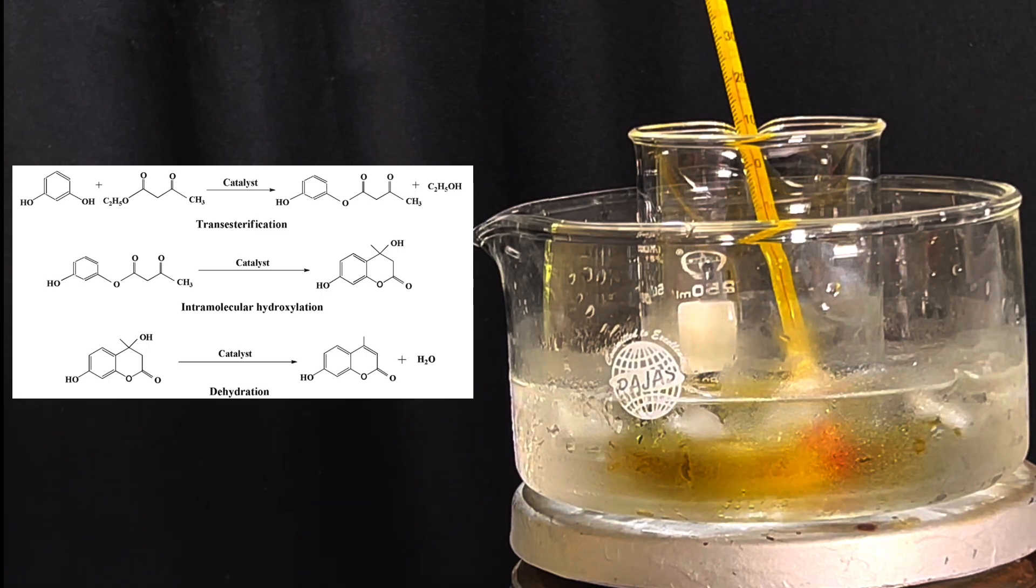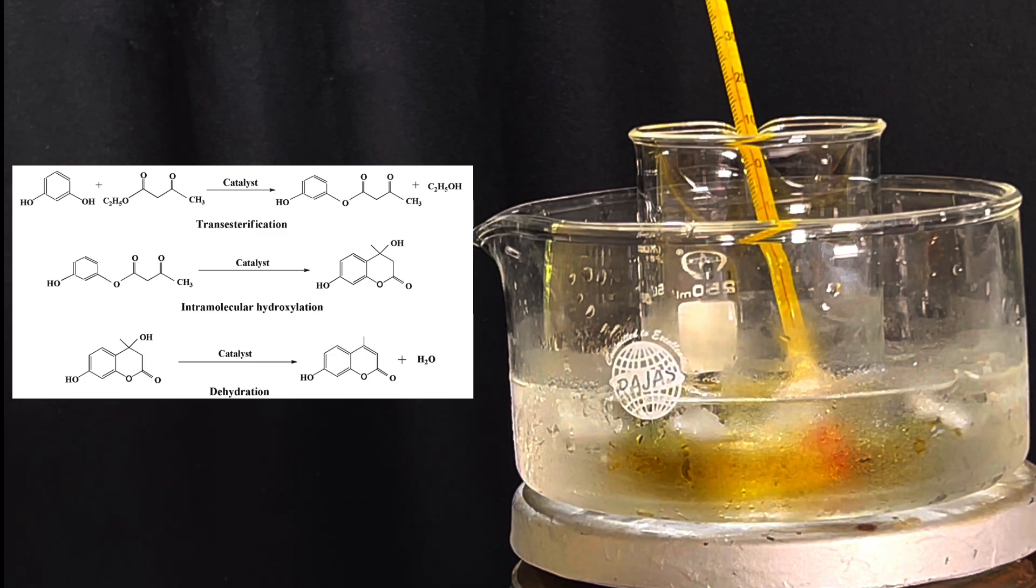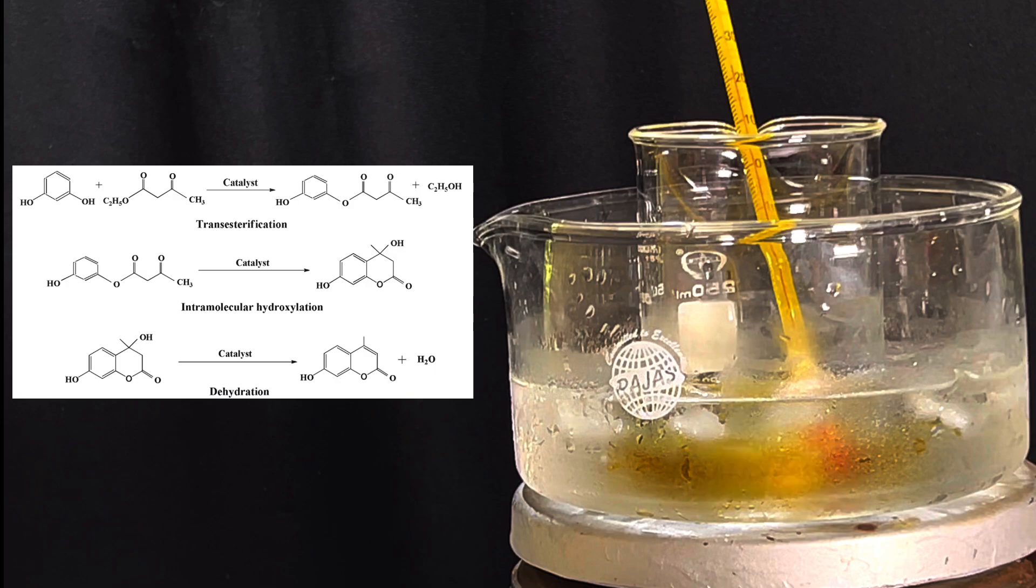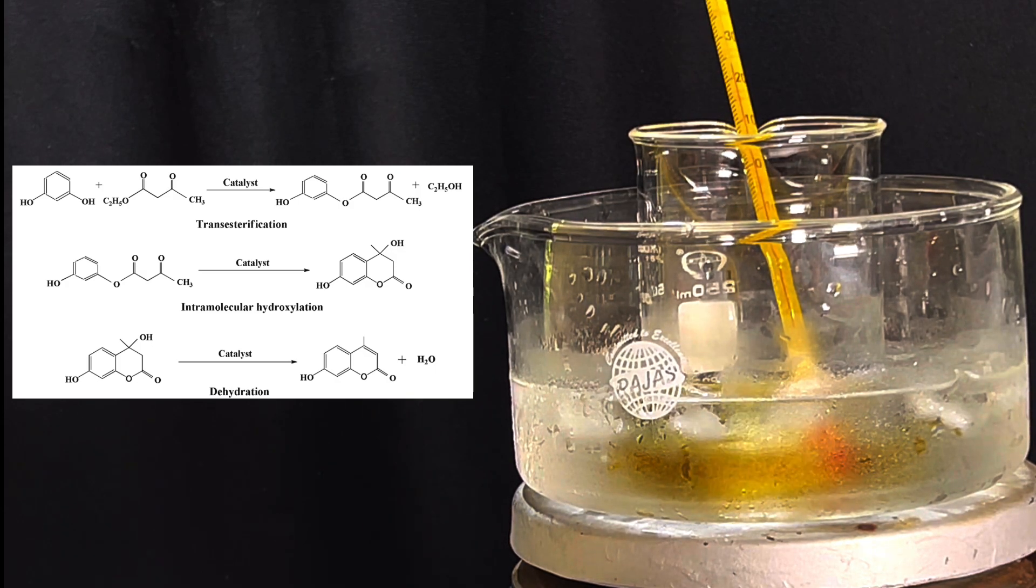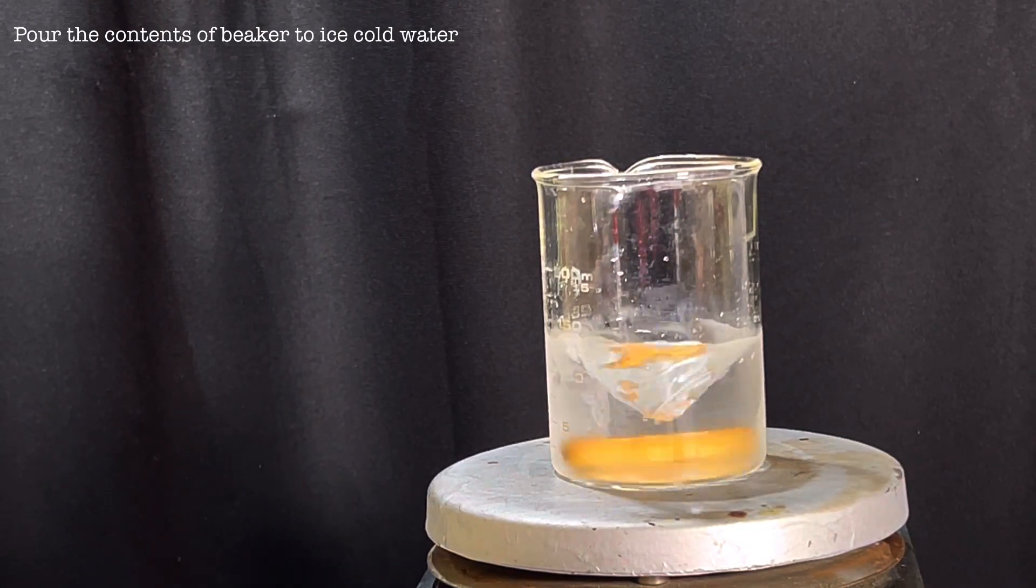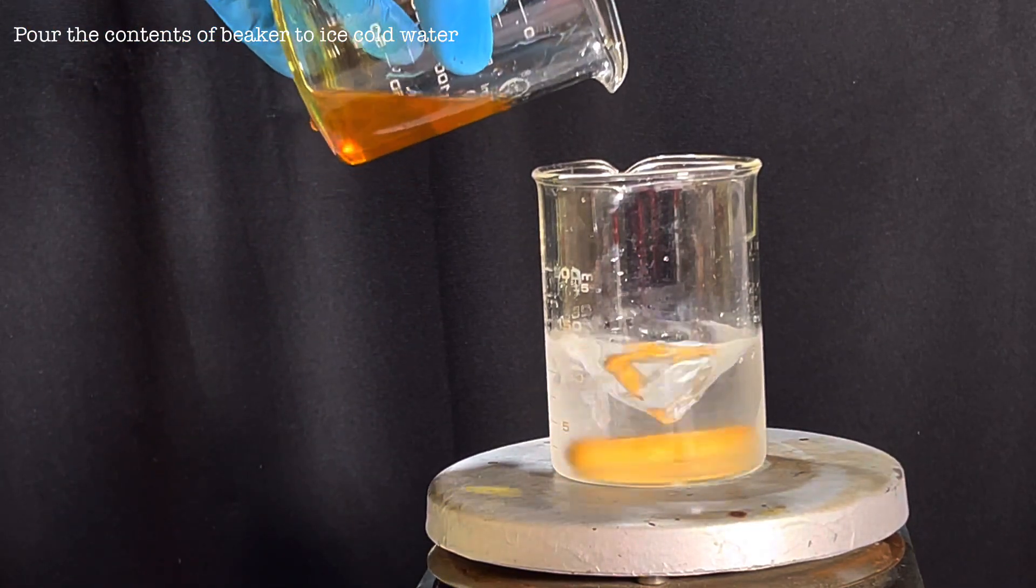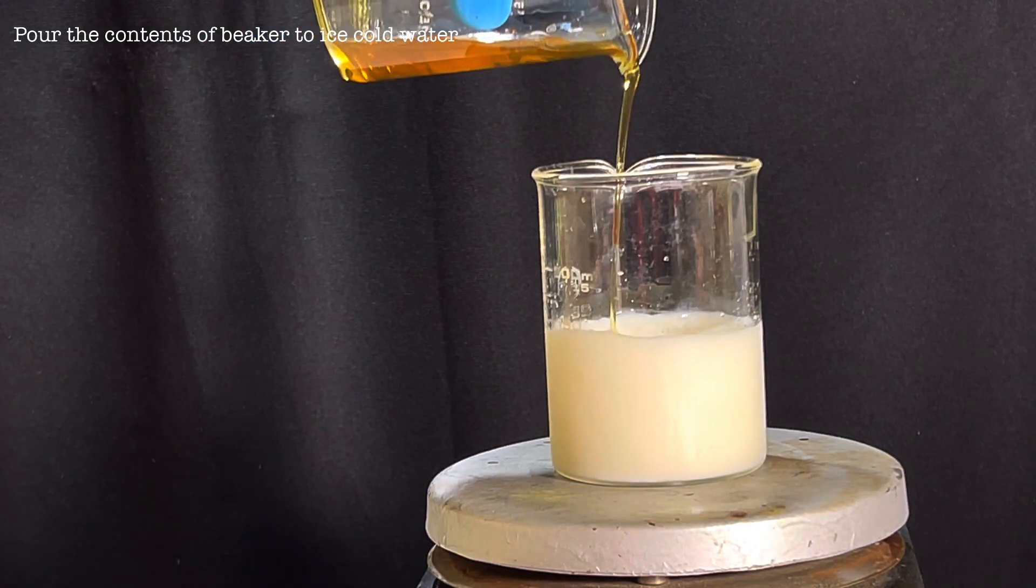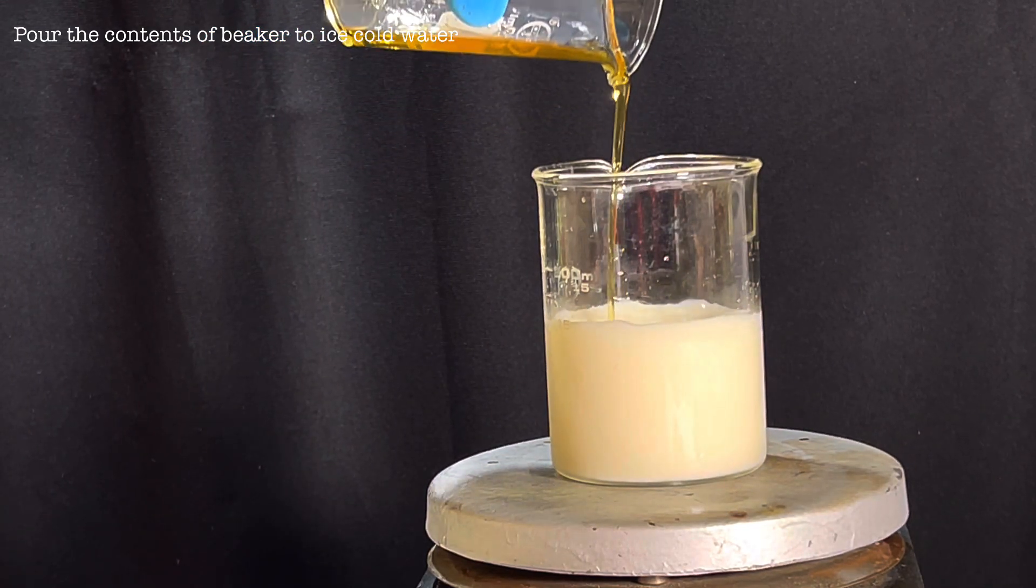Once all the resorcinol ethyl acetoacetate mixture is added to the sulfuric acid, the mixture was kept stirring for 10 minutes to carry the reaction forward to completion. Then, with the stirring turned on, the contents of the beaker was poured into ice water taken in a beaker. Immediately you see the formation of a pale yellow precipitate and this is the crude product.